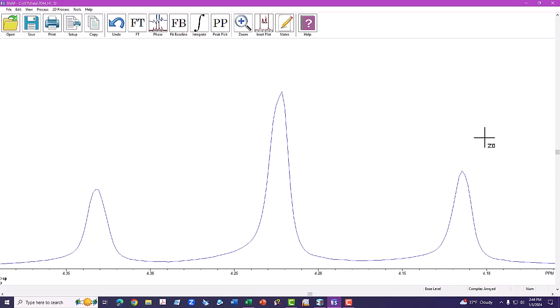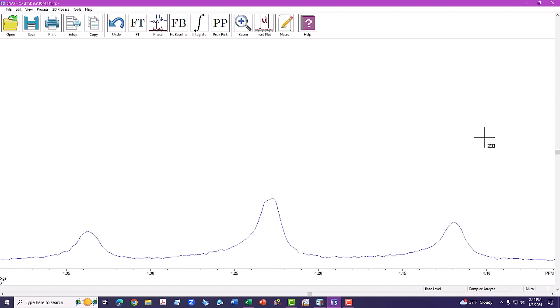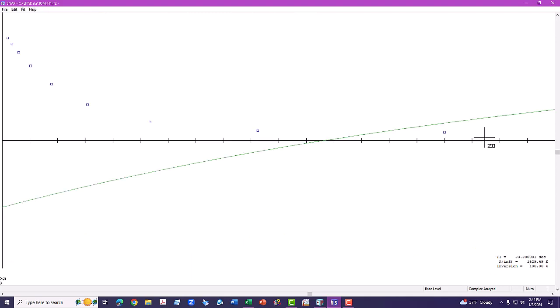And then there's a series of two-letter commands that you have to initiate. The first one, GR, get relaxation data. That just went through and integrated each slice in the region that is shown on the screen. The second two-letter command is DR, like display relaxation data. And you notice that we get these squares on the screen indicating what the integrations were for the different peaks.